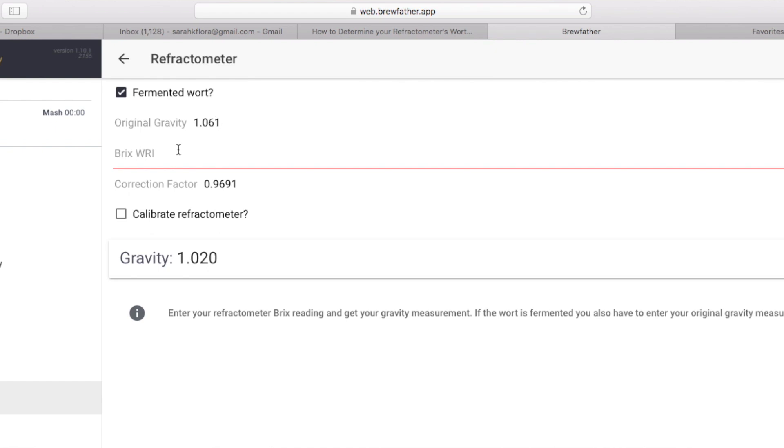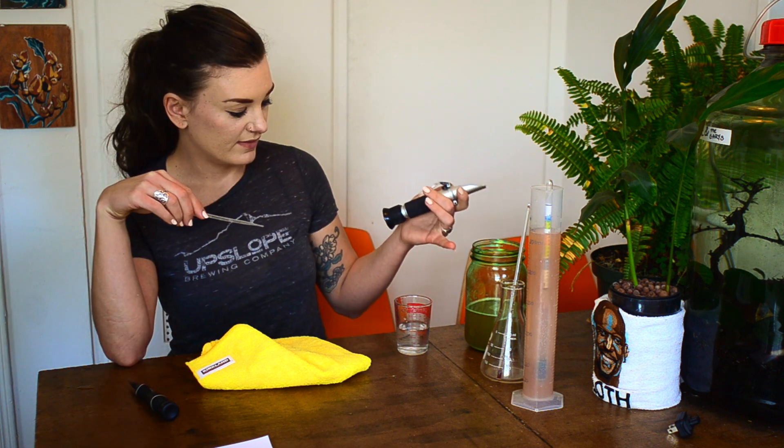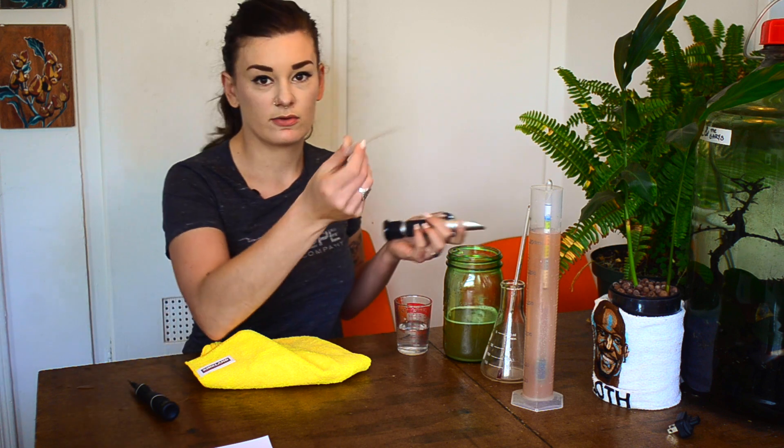Refractometers don't read final gravities as well as hydrometers do, so there's also a correction needed when measuring beer after fermentation. There are a bunch of calculators online — I do everything in Brewfather, but Brewer's Friend and other sites also have it. You'll see a reading like specific gravity 1.024 or Brix 5, and you plug in your original gravity and final gravity, check 'fermented wort,' and it'll tell you your ABV and actual final gravity.